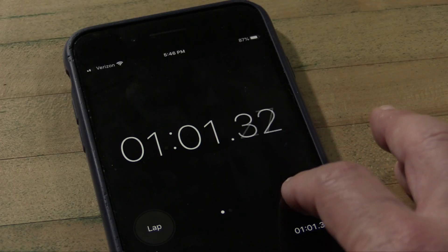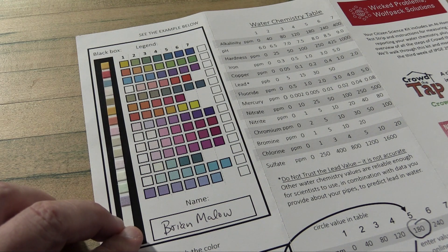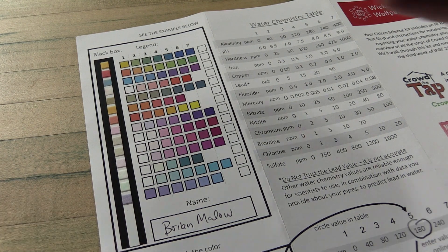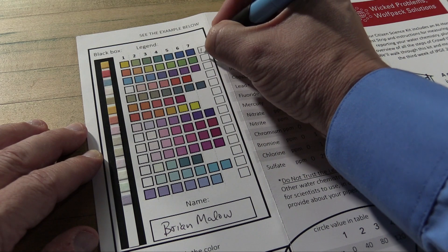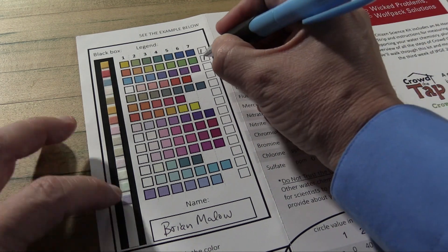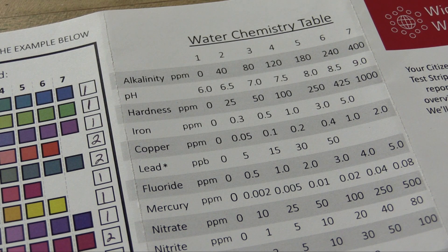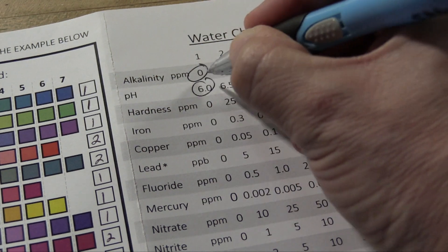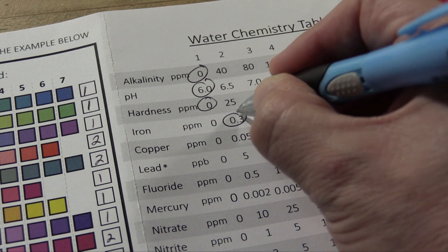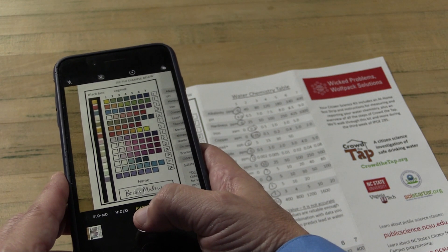It's been 60 seconds. Now, in each row, compare the color of the test result to the options provided by the legend and choose the one that's the closest match, and write the number in the square at the end of the row. Then for each row, take the number and find the corresponding number in the water chemistry table, and circle the value associated with it. Do that for all of them. Take a photo of the test strip and the boxes you filled out — you really only need what's within the black rectangle.